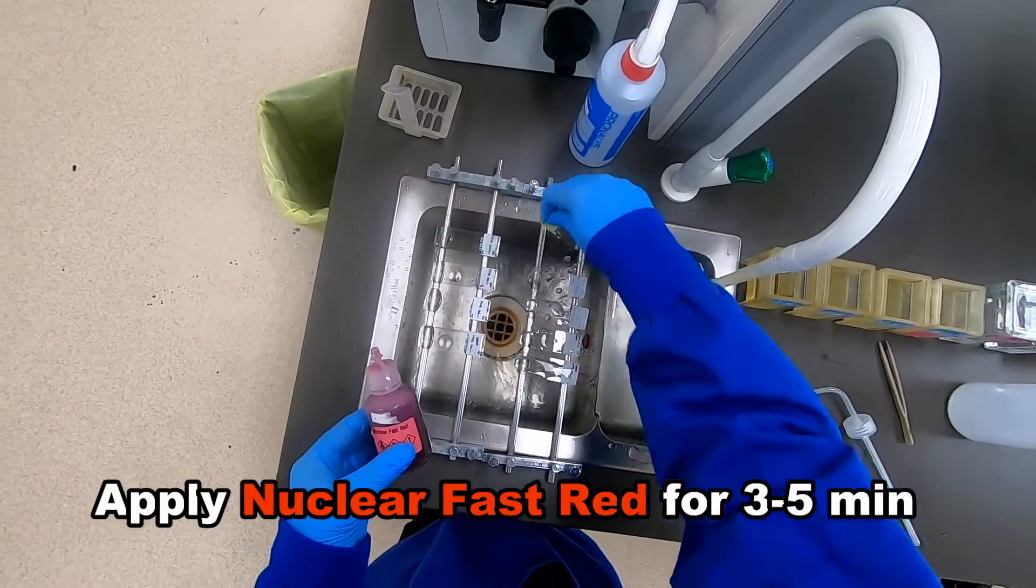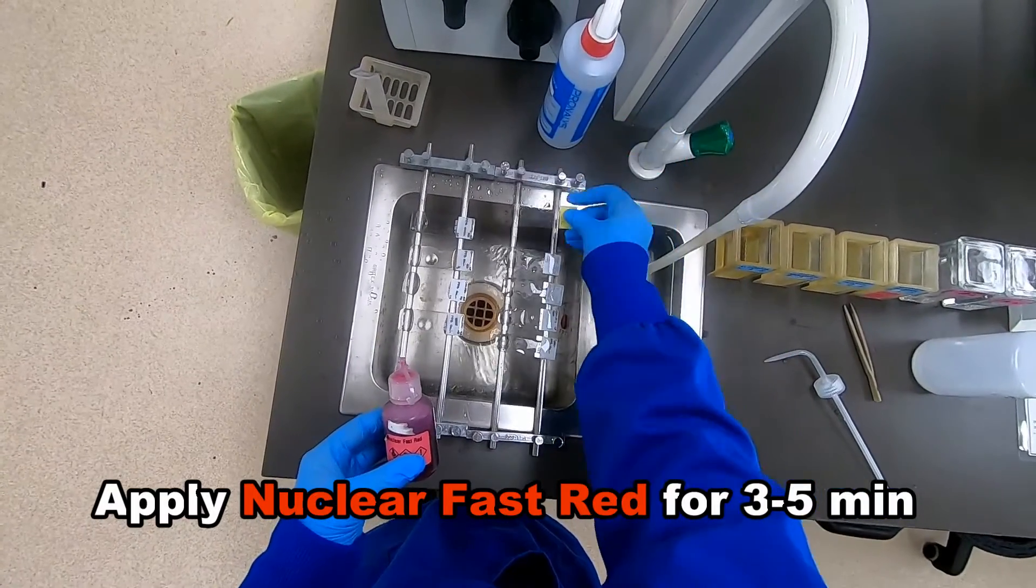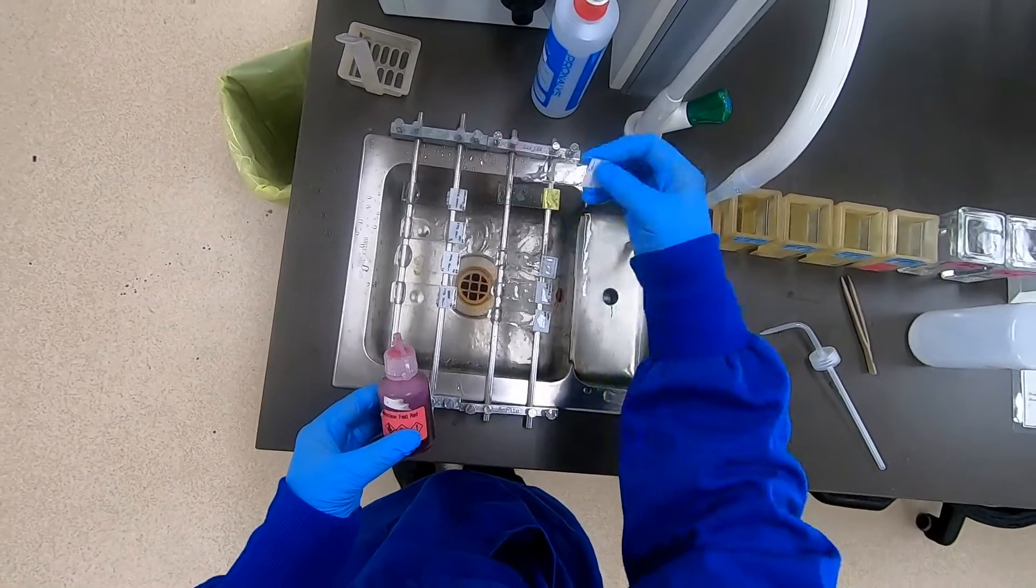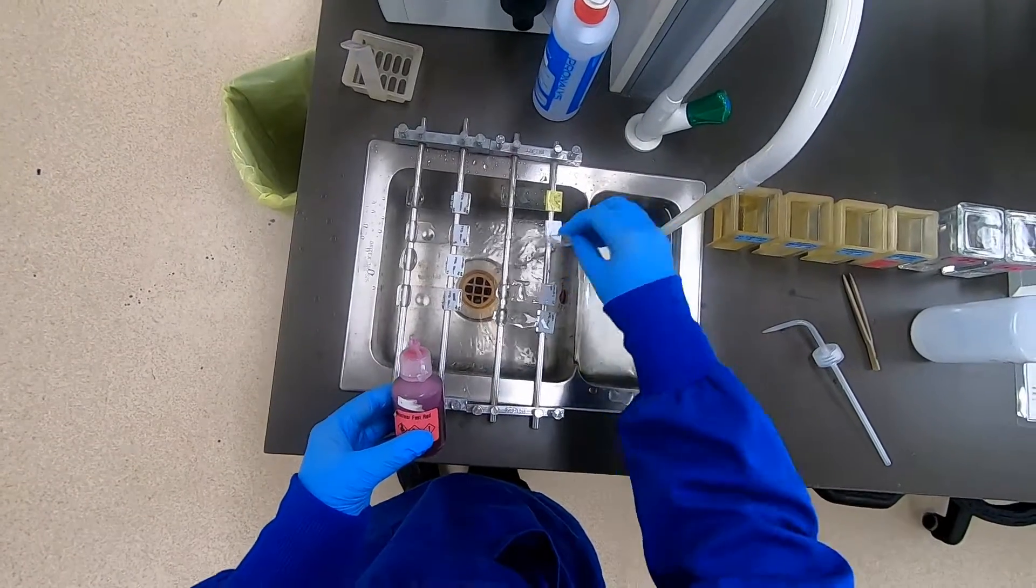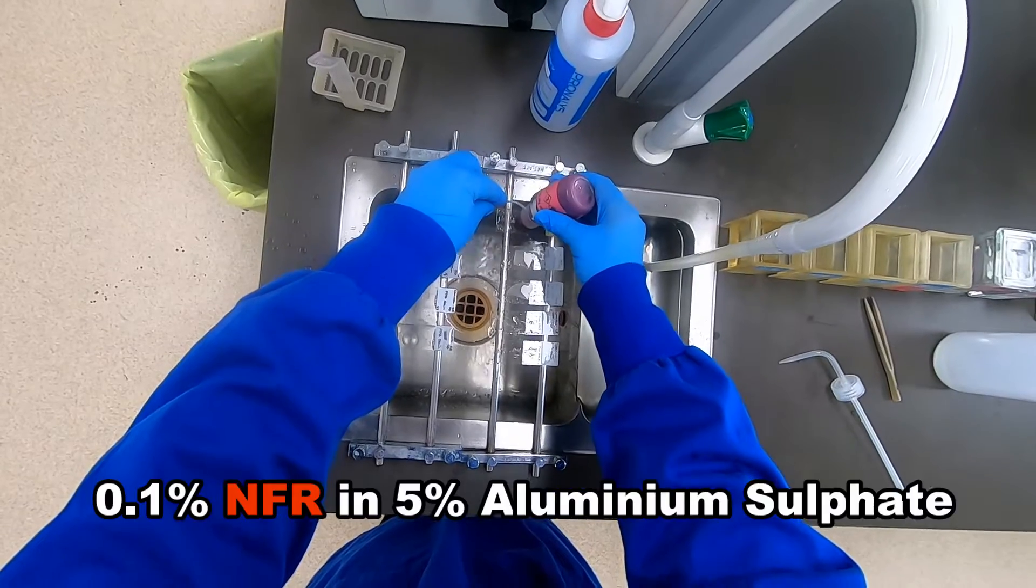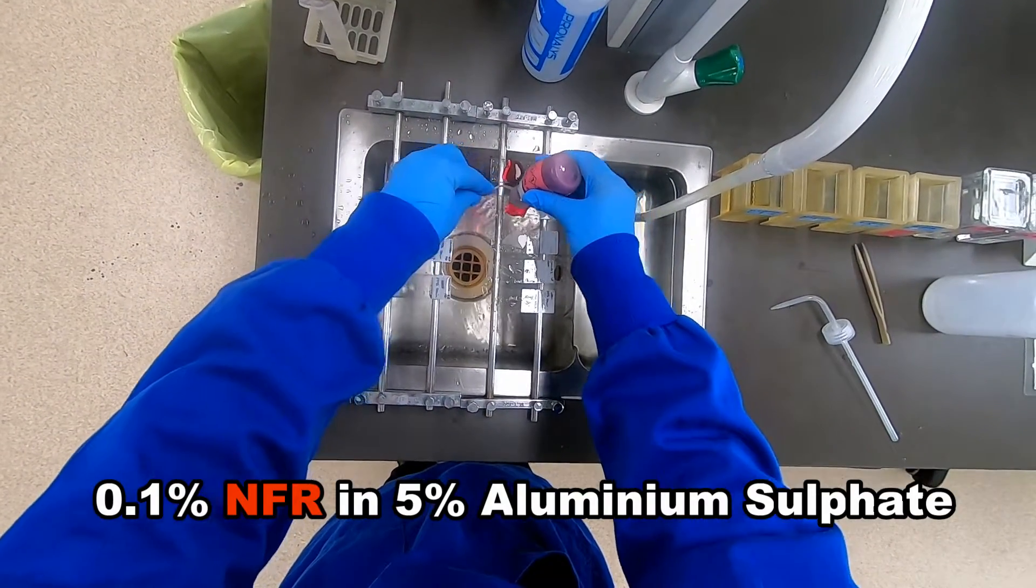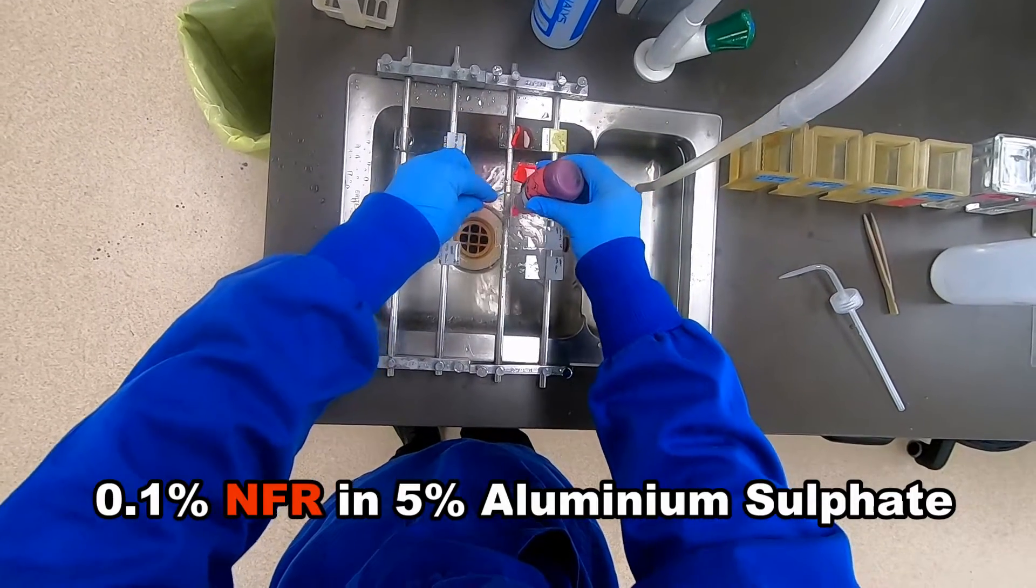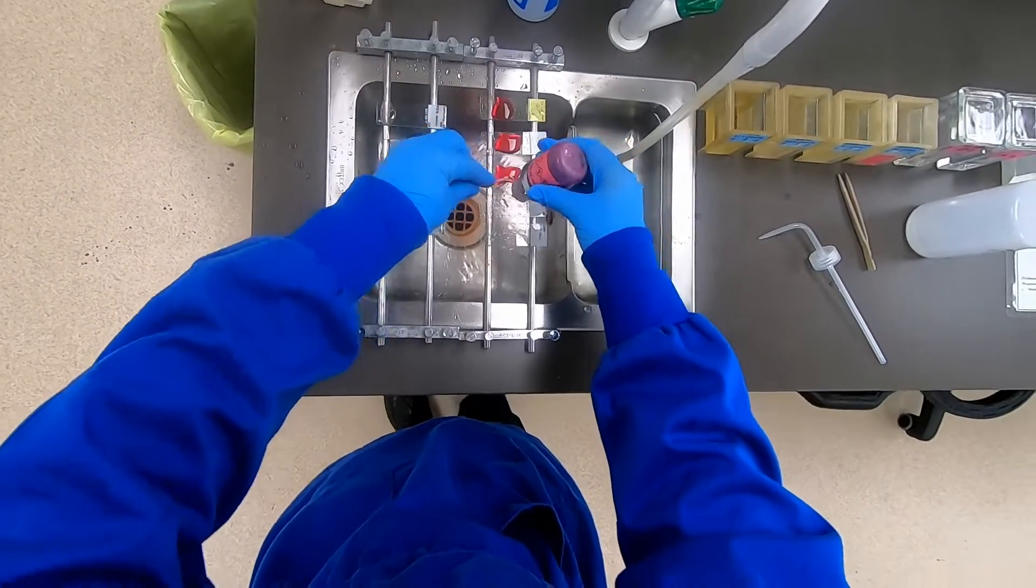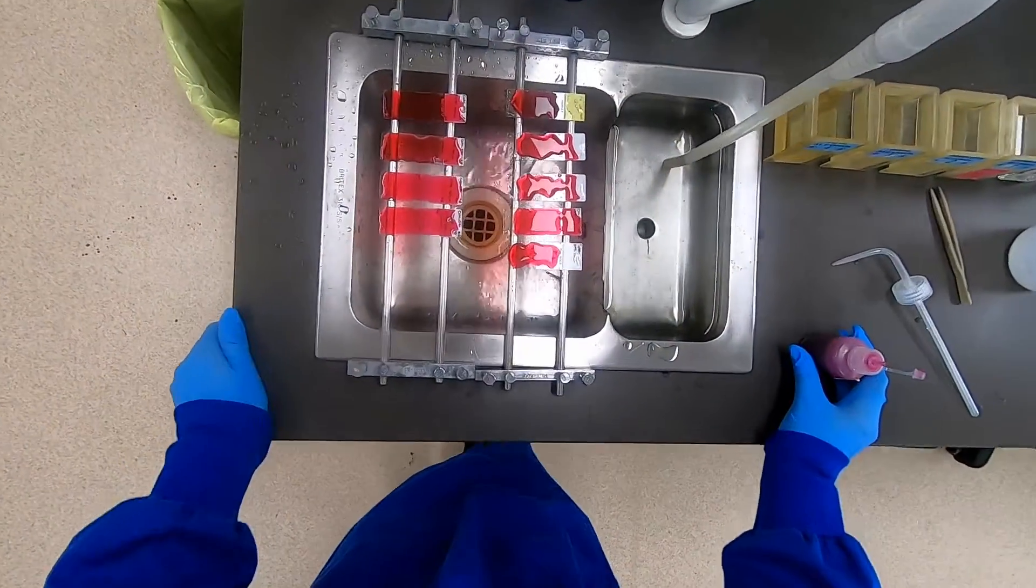Finally, you've got a choice with the counter stain that you use. You may recall some of the colorful alternatives that Chris Casier has been experimenting with here in the lab, but on this occasion we're going with the standard nuclear fast red and we apply that for approximately three to five minutes.